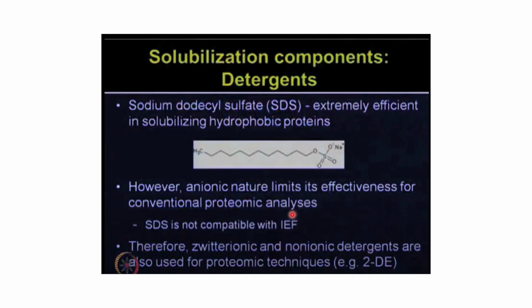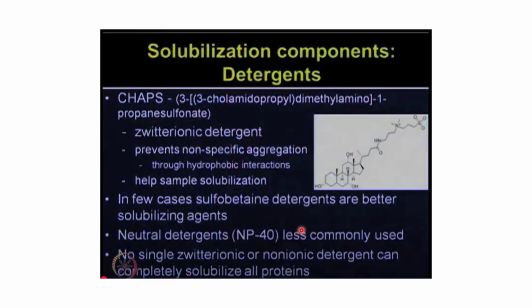Depending upon your aim, the type of analysis you want to do, and the type of protein you have, the initial sample preparation changes. For example, if you are dealing with IEF, you should not dissolve your protein in SDS first. You can do it later if you are doing two-dimensional electrophoresis, but in the initial step you cannot, because isoelectric focusing is not compatible with it.